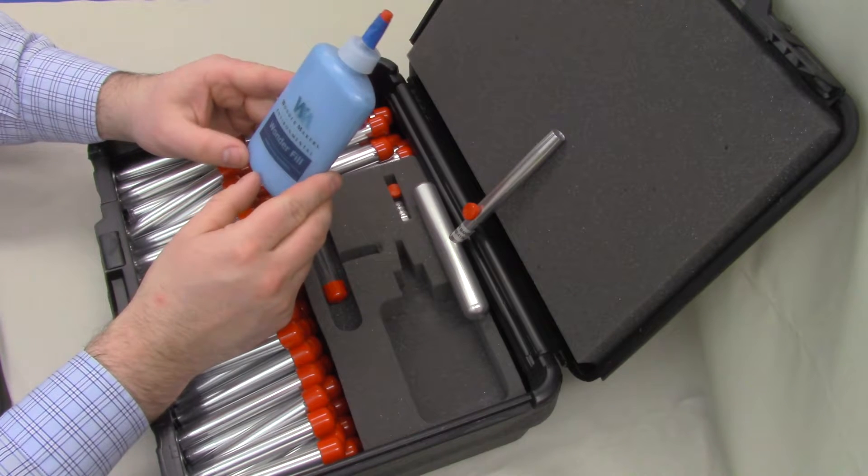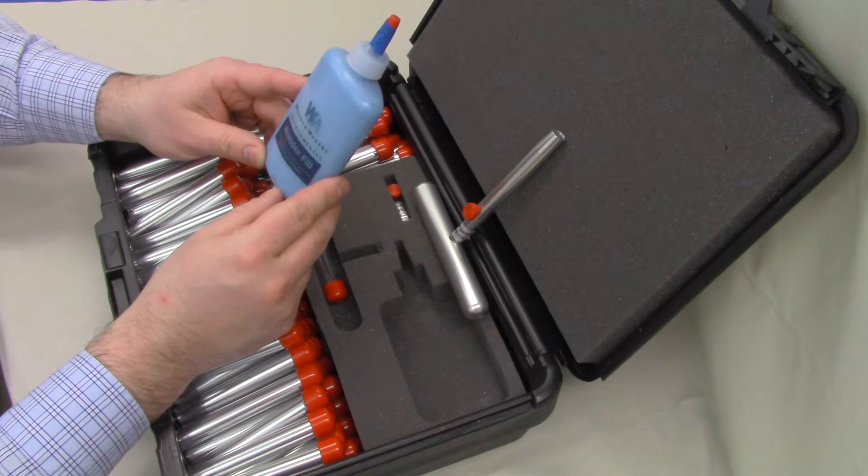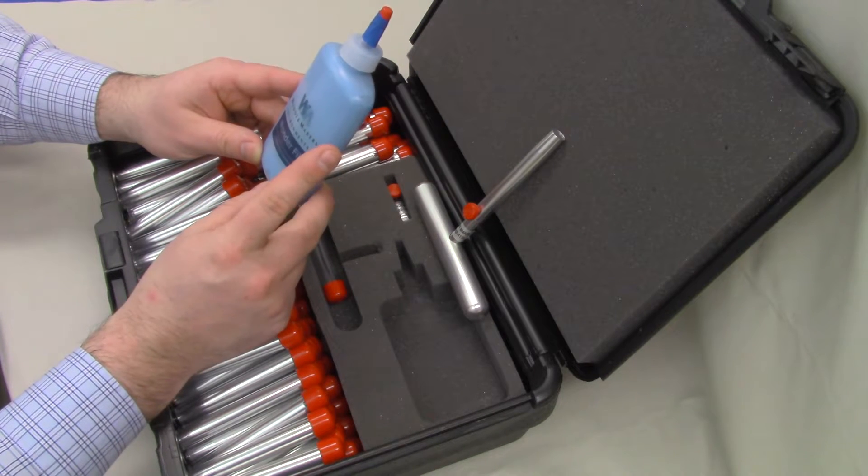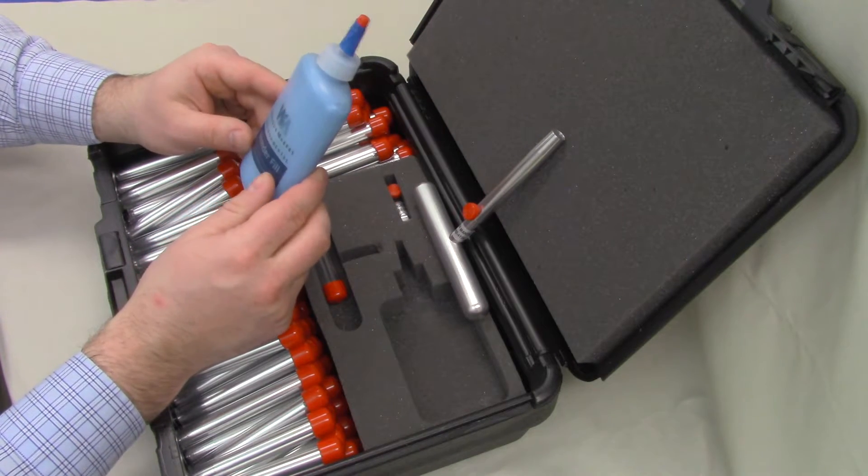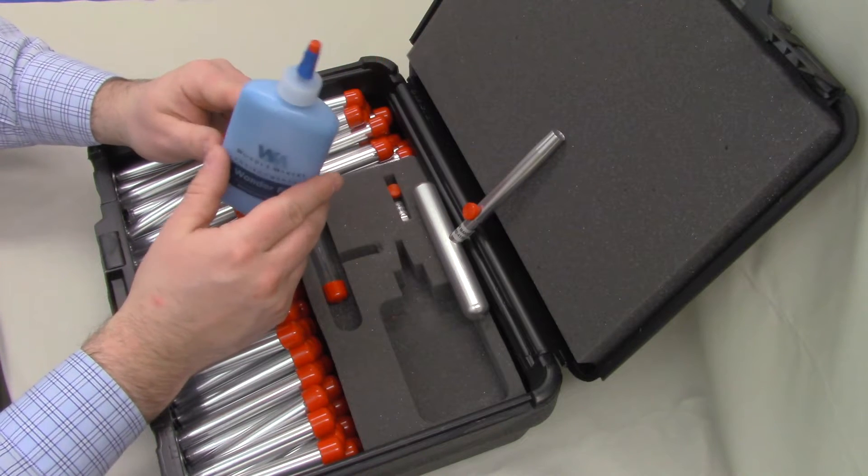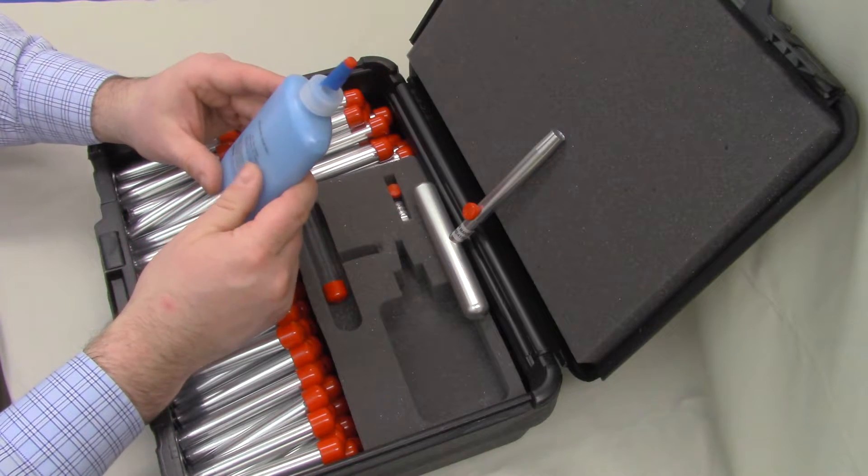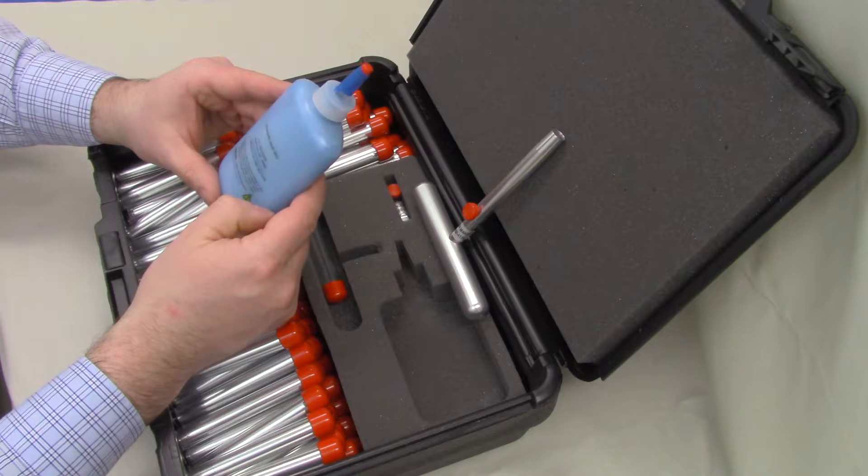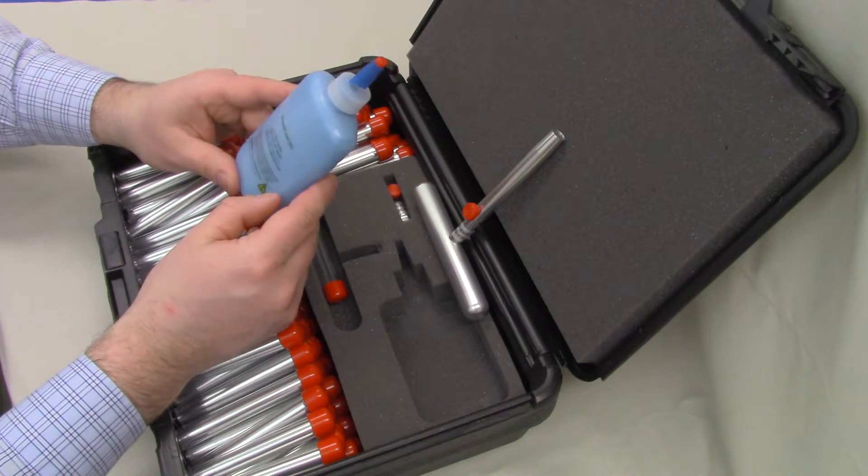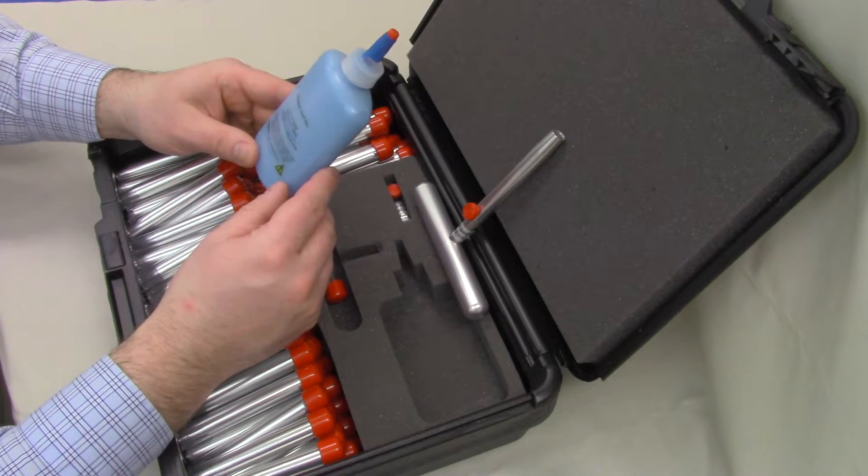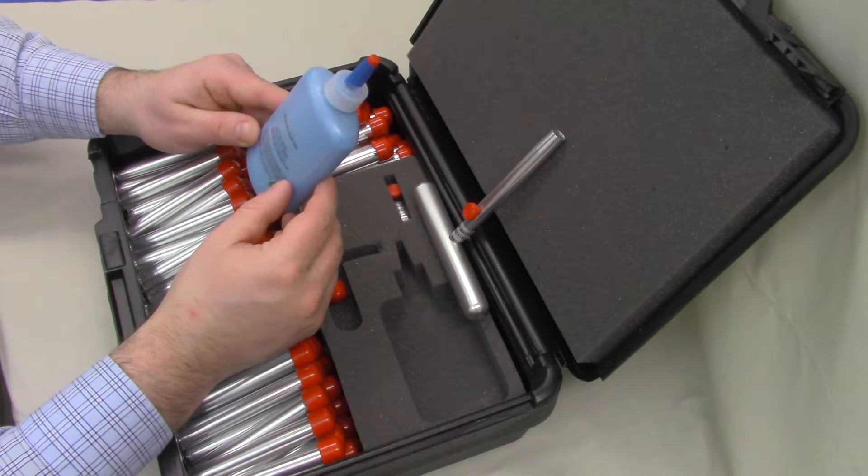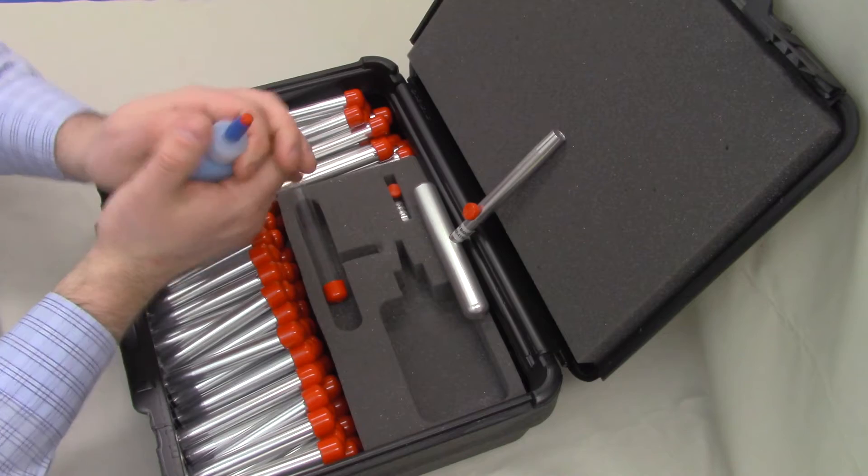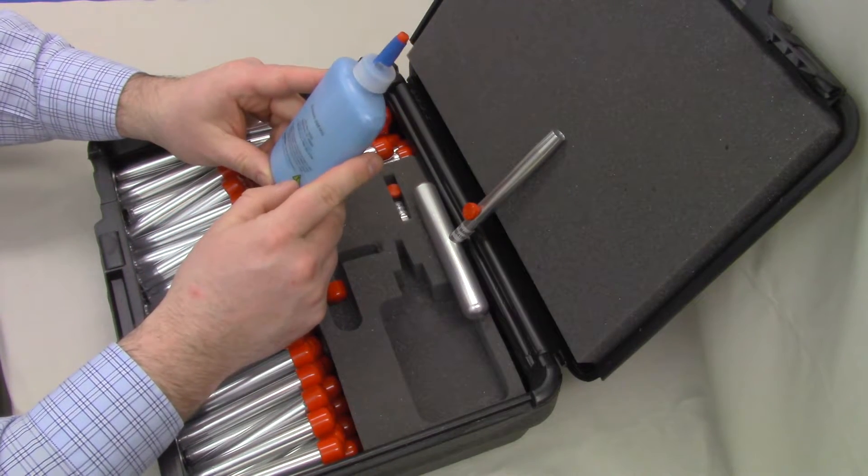This is an insulative product. It is temperature-resistant once dried. It is sensitive to temperature while it's still in a semi-liquid form like this, in so much as it gets more viscous when it's cold, more runny when it's hot. You don't really want to let it be stored in extreme temperatures. If it is in your car, and you're doing some sampling later, and it was cold out there, you can hold it in your hand or even put it inside your jacket for a little while to warm it back up.